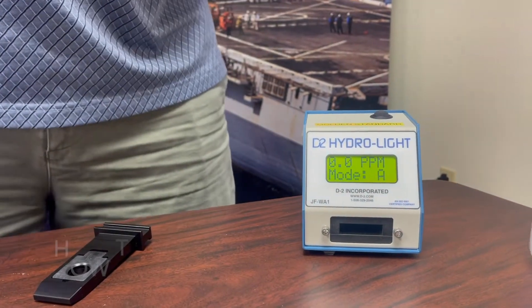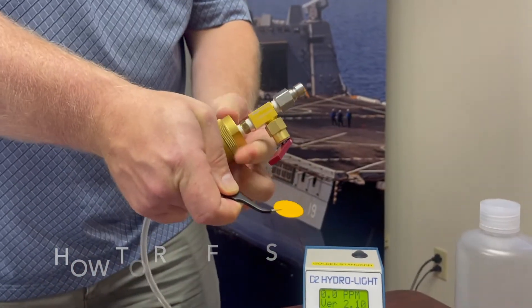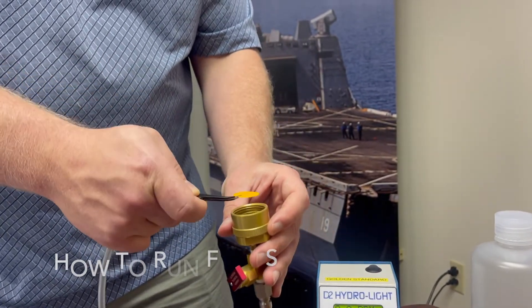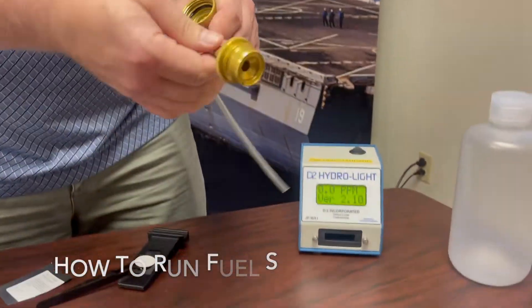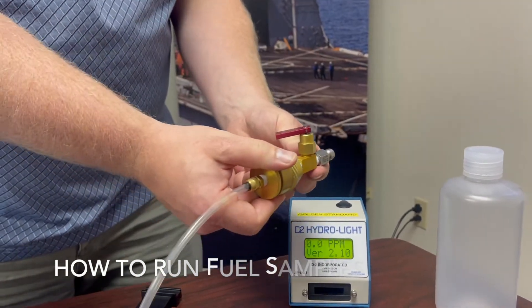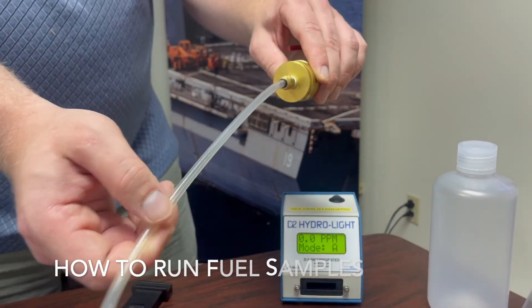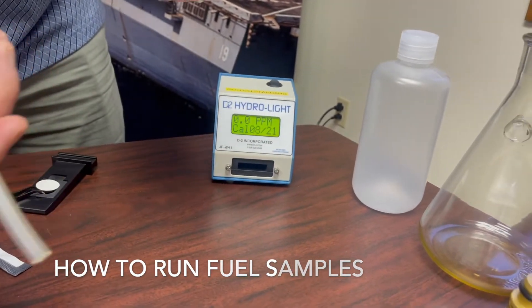There are a variety of different sampling apparatus that can be used. Here we have a typical inline sampling apparatus, which can be opened up and the pad inserted inside. At that point, the sampling apparatus would be closed, attached to a fuel line, valve opened, and 500 mLs of a sample allowed to flow over the pad into a collection container.